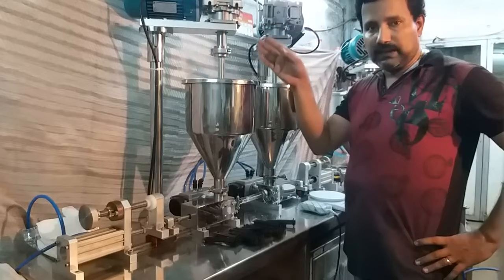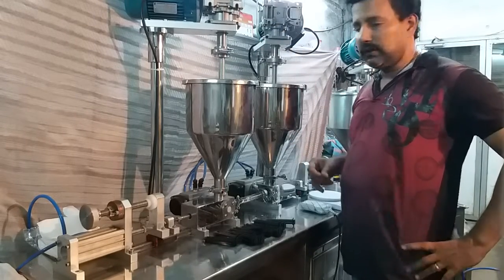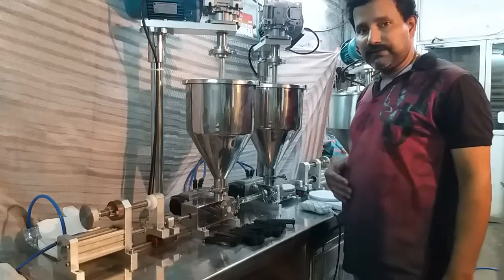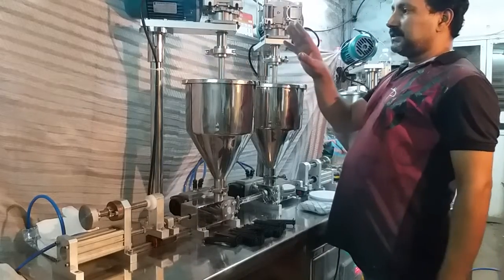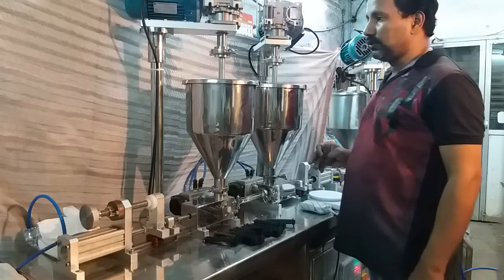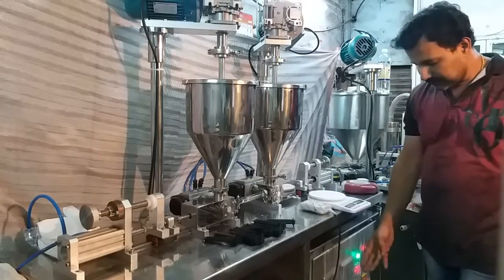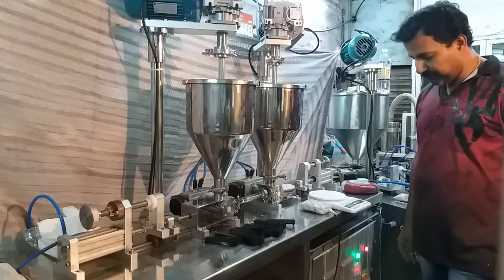There is an independent stirrer motor provided for each hopper so that the product is pushed towards the filling head. There are speed control arrangements for the stirrer motor. On-off switches are provided in the control panel mounted below the top plate.